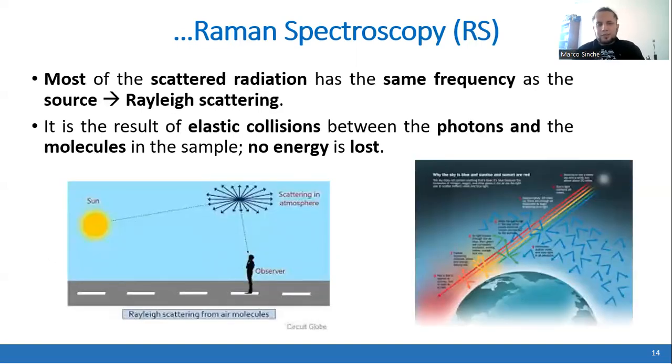The Rayleigh scattering is observed, for example, in the sky when the sunlight interacts with the molecules of oxygen that are present in the atmosphere. So they will become scattered in wavelengths that are close to the visible spectrum in the blue colors. That's why the sky is seen blue by us. But in other cases, if the light comes in a direction that is almost tangent to the Earth's surface, it will be seen as red and white and yellow colors.